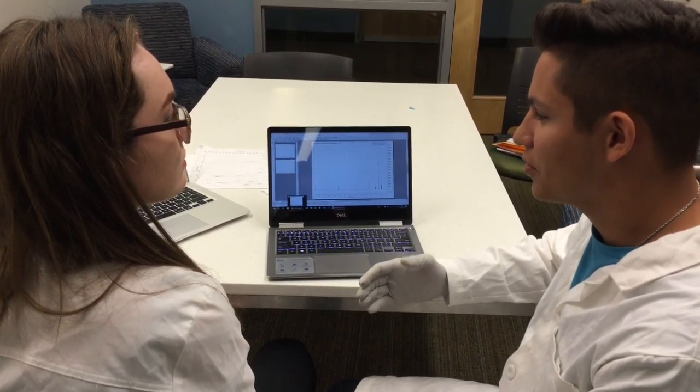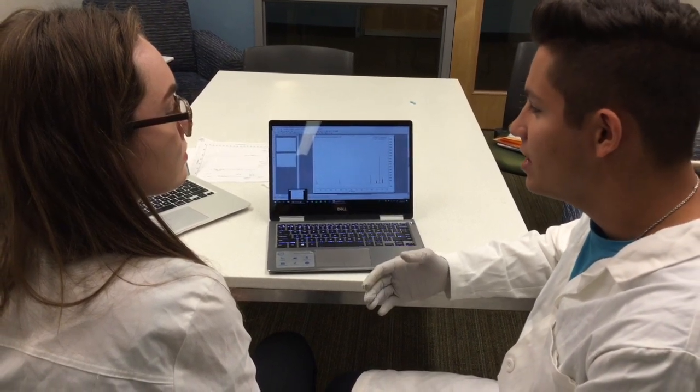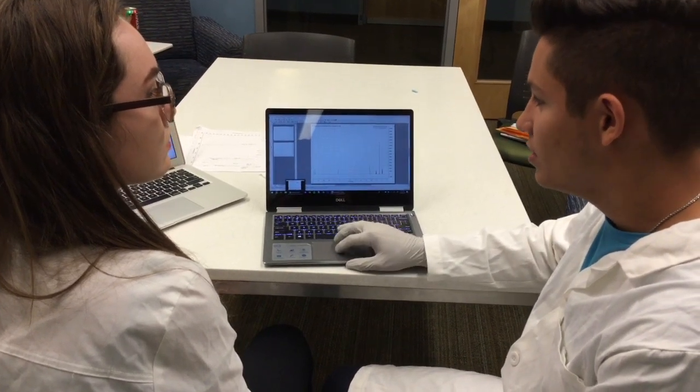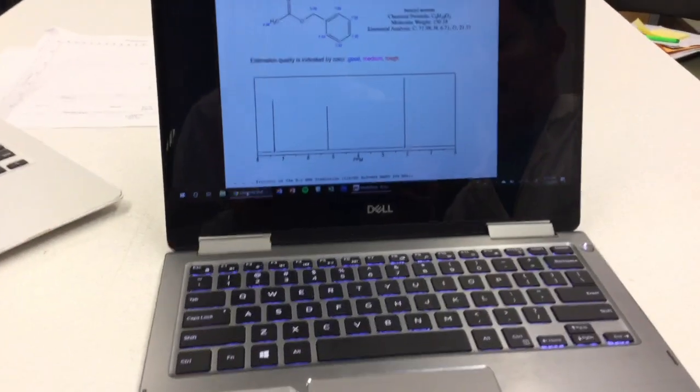For C4H10O, there are 3 possible isomers, and for C9H10O2, there are 4. In order to narrow these down, we first ran the C9H10O2 isomers through the ChemDraw software and predicted their NMRs. Only one of the isomers matched peaks that were found on our NMR, which is benzyl acetate.